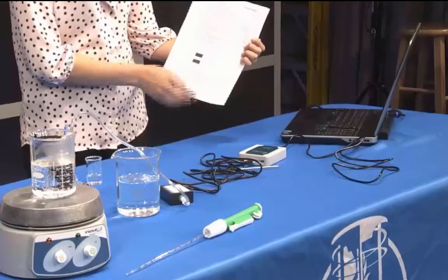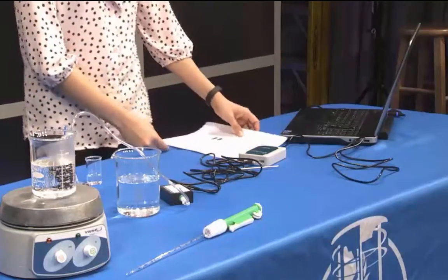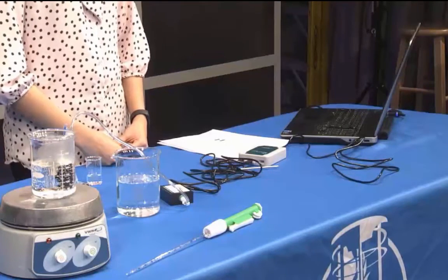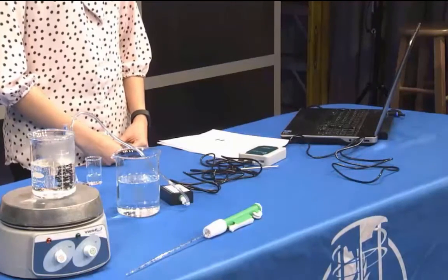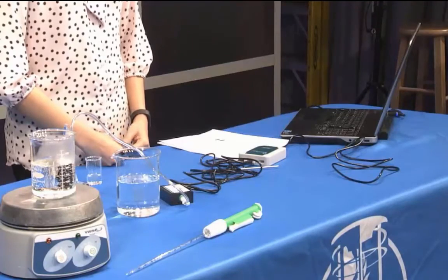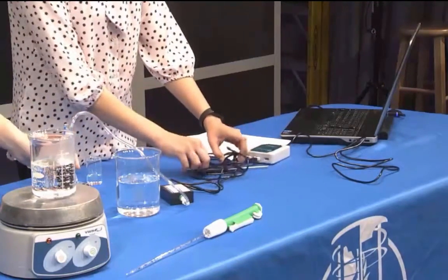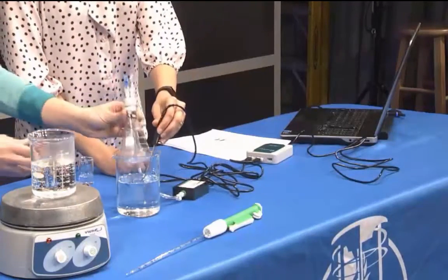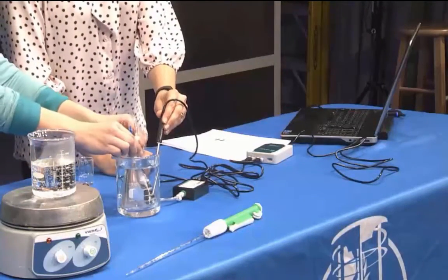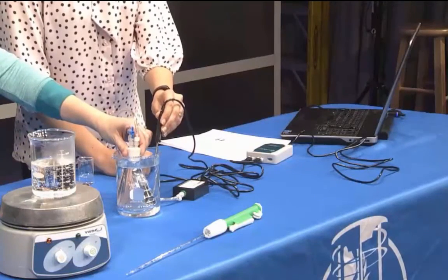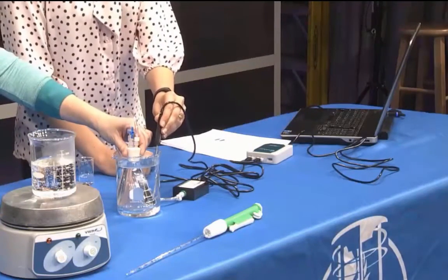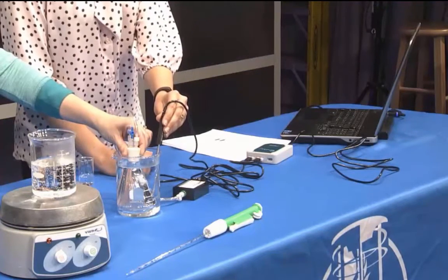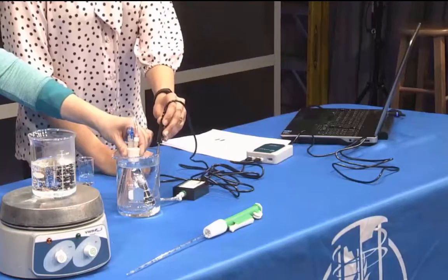Then you will need to condition the Erlenmeyer flask and the sensors to the water bath. Place the temperature probe into the room temperature water bath and place the Erlenmeyer flask in the water bath. Hold the flask down into the water bath to the bottom of the white stopper. One member of your group should hold the flask very still in the water bath the whole time during this experiment.